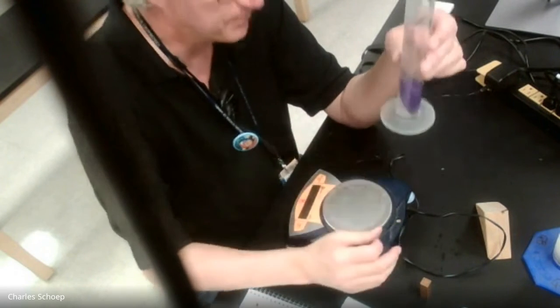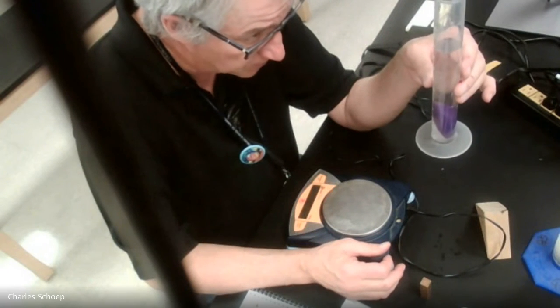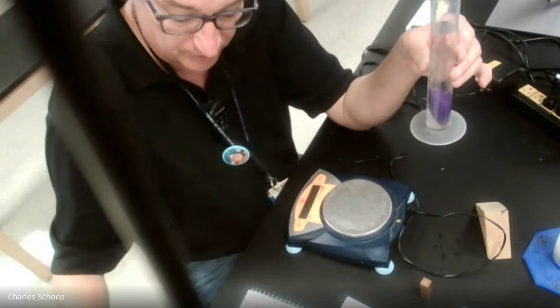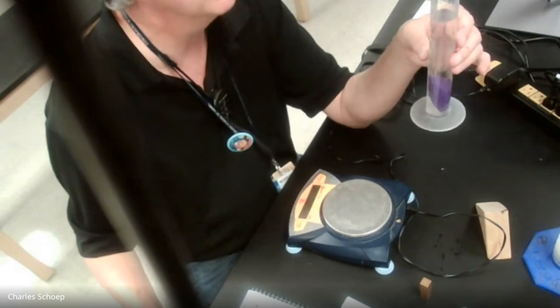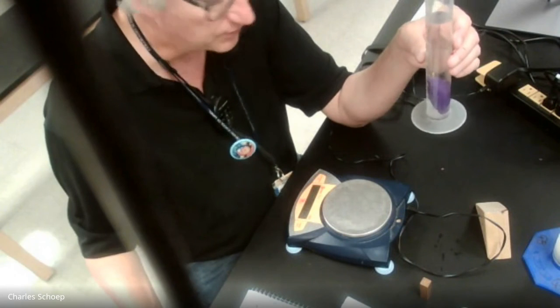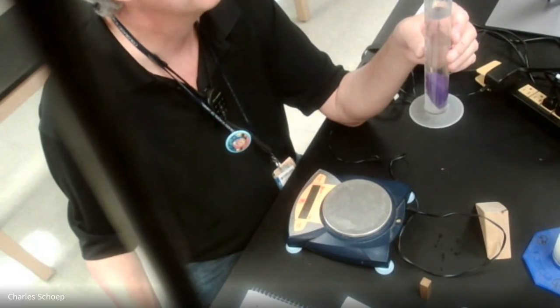If I drop that guy in there, it goes up to 89.7. So we went from 71.5 to 89.7.